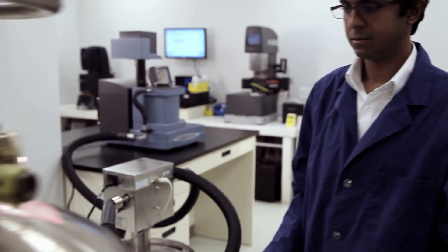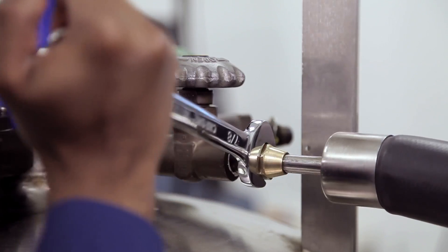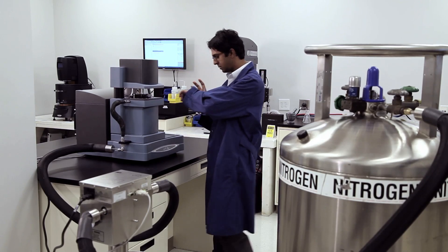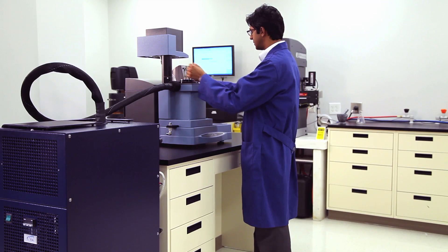For many DMA or rheology experiments requiring sub-ambient temperature control, liquid nitrogen is the most common cooling method, but it can be cumbersome and expensive. The all-new ACS3 is a compact, affordable alternative that is safe and simple to use.